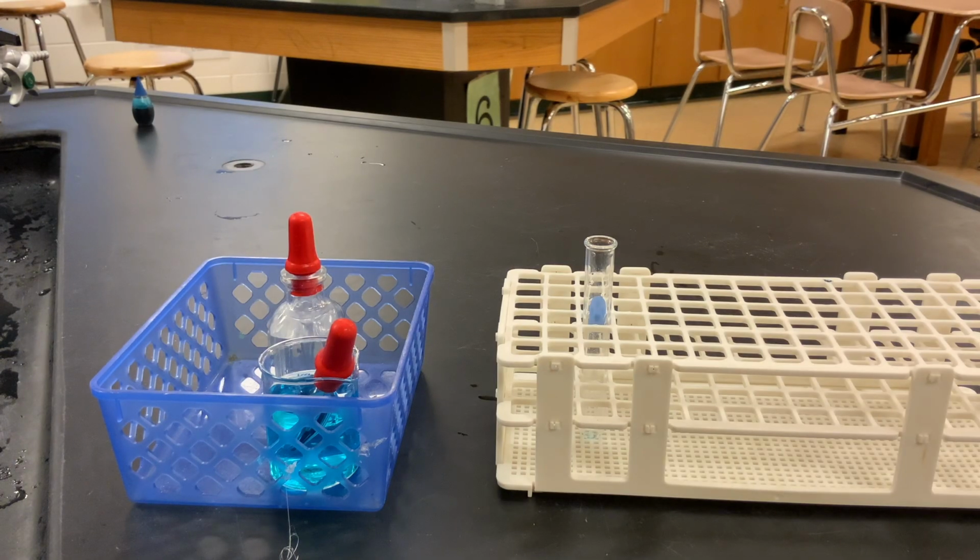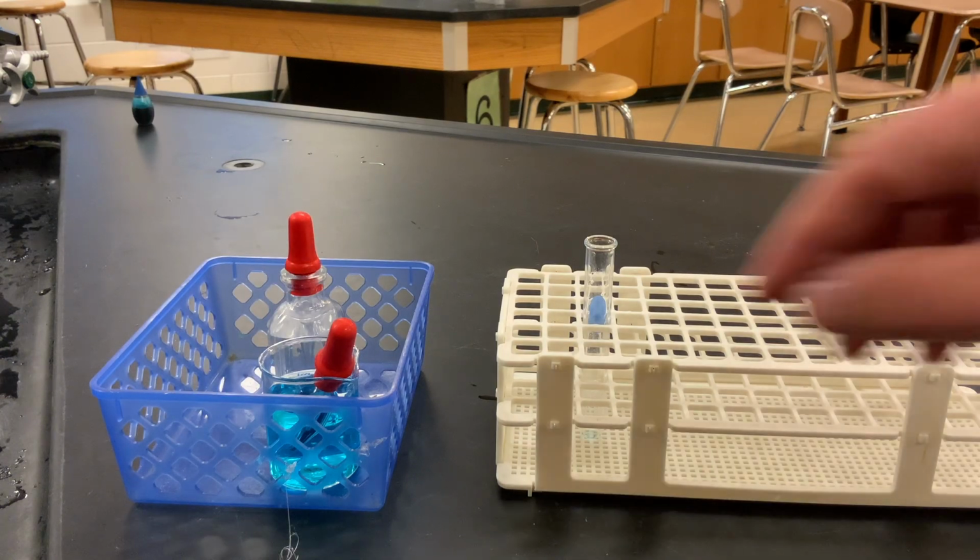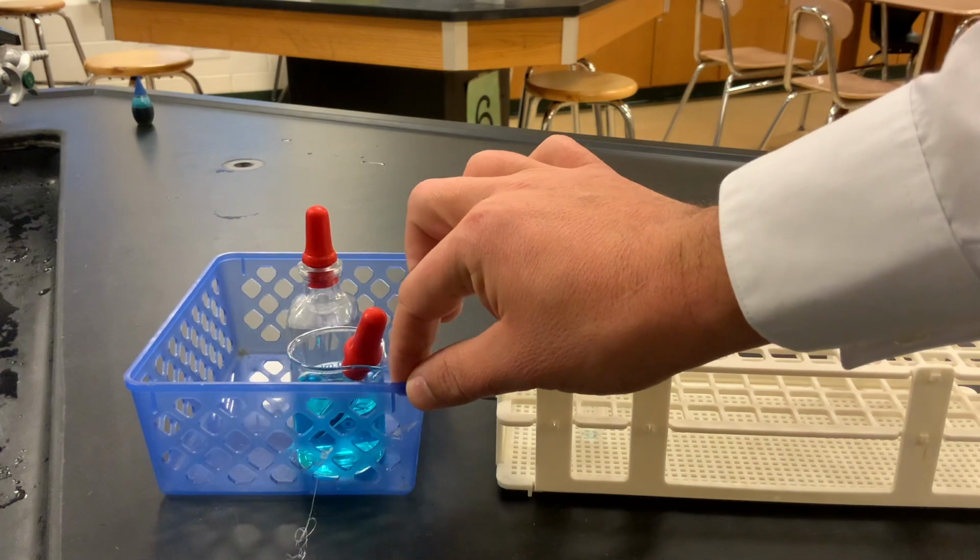I'm going to show you a few technique things for our lab now. Main difference for this lab will be I will bring you all of your chemicals, just because a couple of them are flammable and things like that, and I'm trying to keep everything separate so when you get set up for your lab, you're not spilling anything by accident. It's just kind of out of the way. So I'll bring this basket over to you.